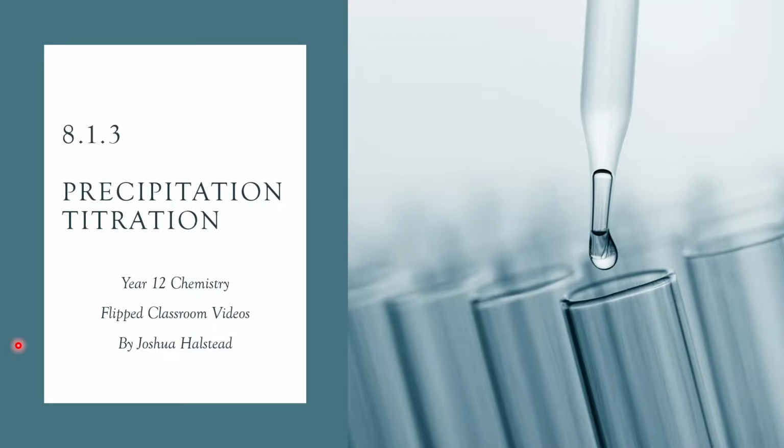G'day chemistry students, in this video we are looking at dot point 8.1.3. Our focus is on precipitation titration, an analytical technique very similar to acid-base titration, but instead of doing a neutralization reaction, we're going to be looking at precipitation.